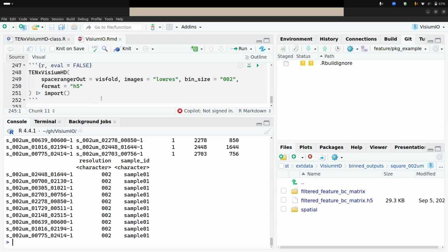I think there's an option with arrow, as data frame false, to not realize it. Yeah, but it might not fit in a colData, and maybe it's not necessary because it's just the coordinates. Because then I filter by all of the barcodes present in the data, so you get a really long colData, but you don't use all of those rows.